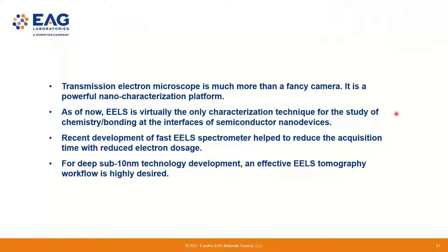So this is the summary of my presentation. I want to leave a little bit more time for questions if you have. This is a summary. Nowadays, TEM is much more than a fancy camera. I think everybody knows this is a very powerful nano characterization platform, right? As of right now, electron energy loss spectroscopy is pretty much the only type of microscopy technique for the study of both chemistry and bonding at the interfaces of semiconductor nano devices, right?